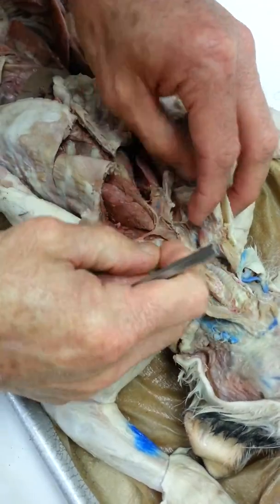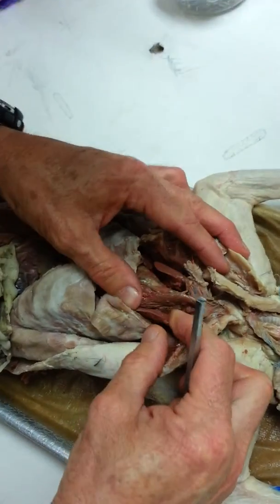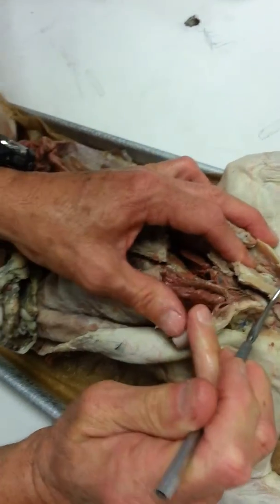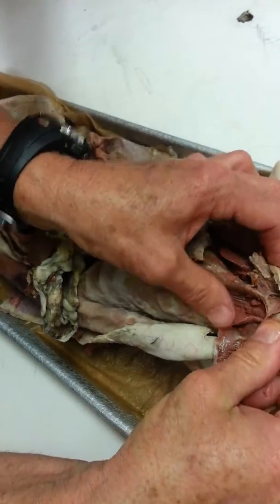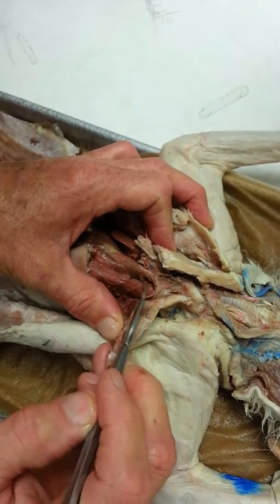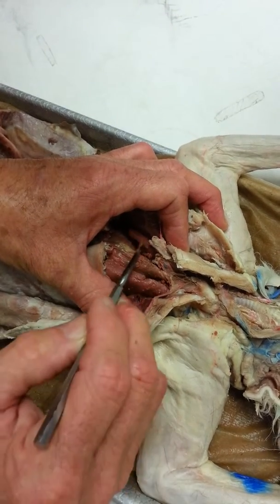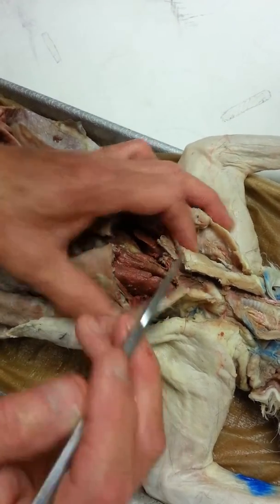So then down here on the heart area, this structure right here, if I can get hold of this. Pull this back. Open up very well. Yeah, this is bad. This is the thymus gland right here. Runs from the top of the heart to the trachea. That's all thymus right here in the middle. This is lung, and this is lung. And that's the thymus in the middle.